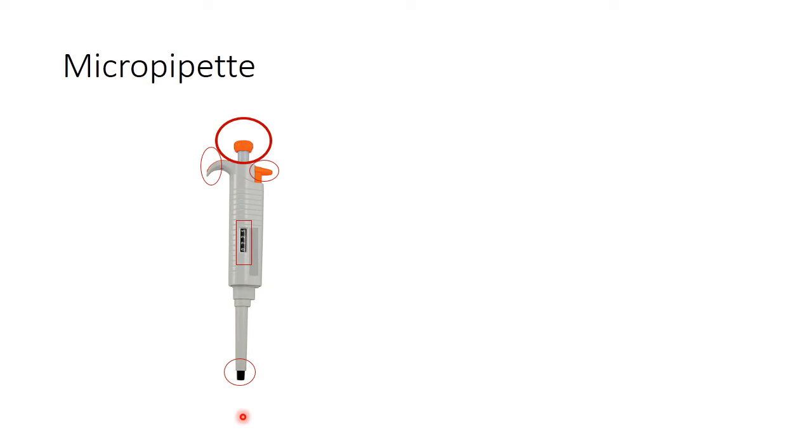Now, depending on the number of tip cones or tip knobs, micropipettes can be of two categories. If there is only a single tip knob or single tip cone, that means it can aspirate one sample at a time. This is known as single channel micropipette. Now, look at this. It has multiple tip knobs and it can aspirate many samples at a time. It is used in enzyme linked immunosorbent assay for estimation of tumor markers and hormones. This is known as multi-channel variant of micropipette.